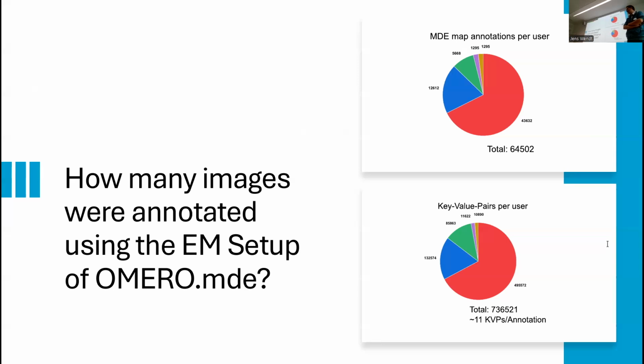According to our plan, data should either be moved to the users group, or if we want to keep it, be duplicated, where OMERO duplicates, doing this hard copy stuff, and then moved to the users group, including all the metadata. But this obviously does not happen yet, at least not to a big extent. So they get the raw data from them somehow.